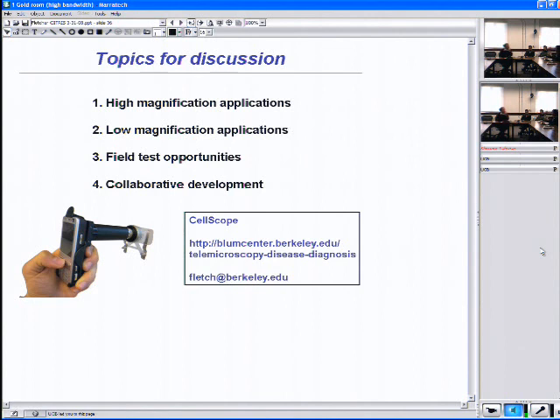Today, we can buy a very low-cost microscope to see blood cells, whatever, with 40x magnification. But I could see the cost of the optics here is not so low compared to the lowest-cost microscope today. So I don't see the benefit at this moment of adding optics to a cell phone. But I think the benefit is that the cell phone's camera has a very low-cost chip, and it has communication ability also, and memory. Right. I think we have to think about the store and forward capability of scopes. I think we can find a very good application.